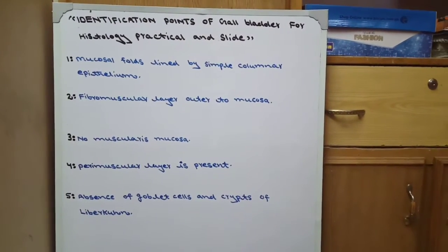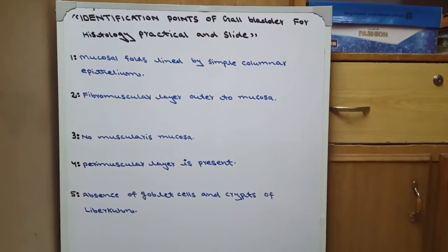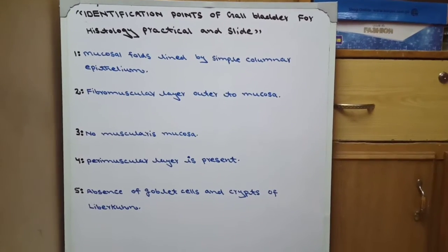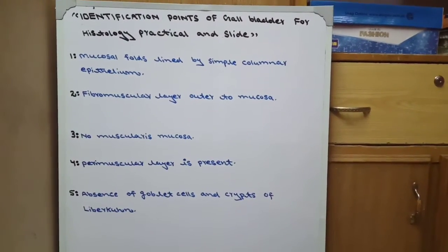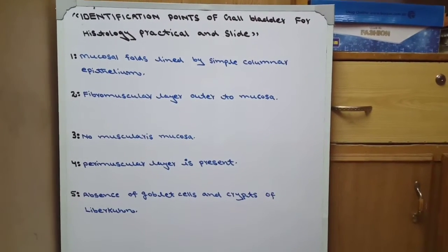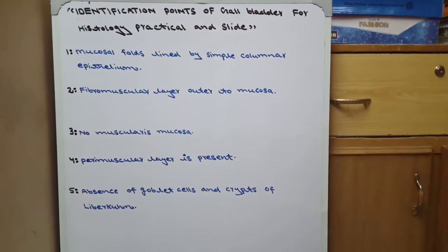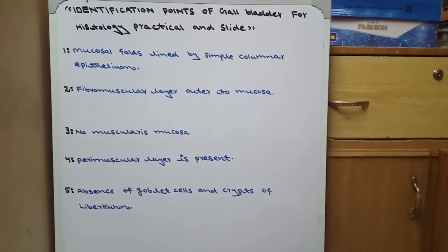I already uploaded the detailed slide explanation video of gallbladder on my YouTube channel. Go and watch that video. Now I will upload these identification points also. On my YouTube channel you can find general histology, special histology, each slide detailed explanation video and each slide identification points for practical and slide.